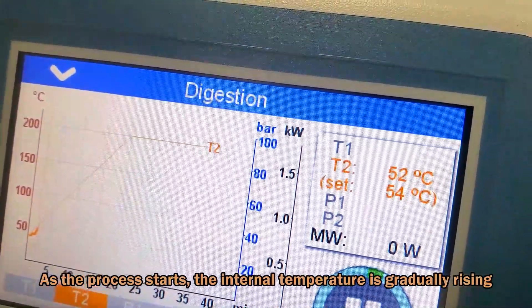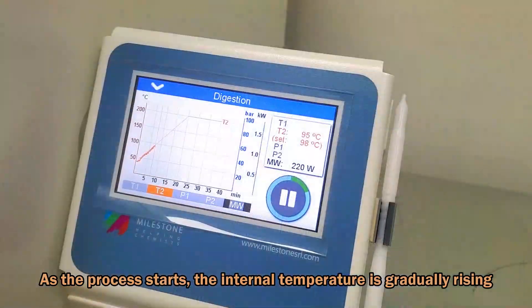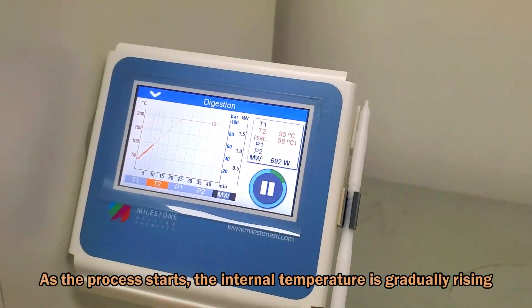As the process starts, you'll notice the internal temperature gradually rising, indicating that digestion is in progress.